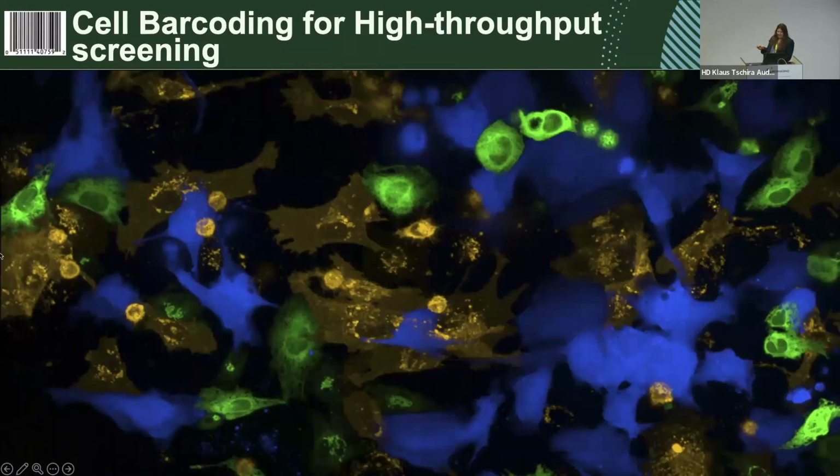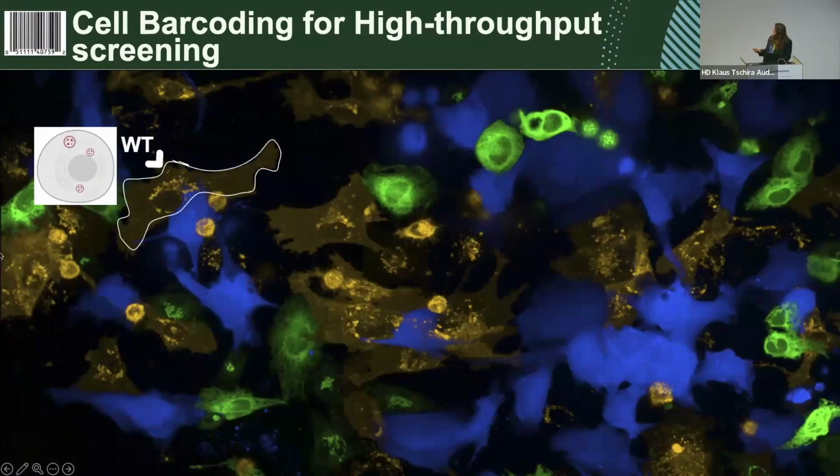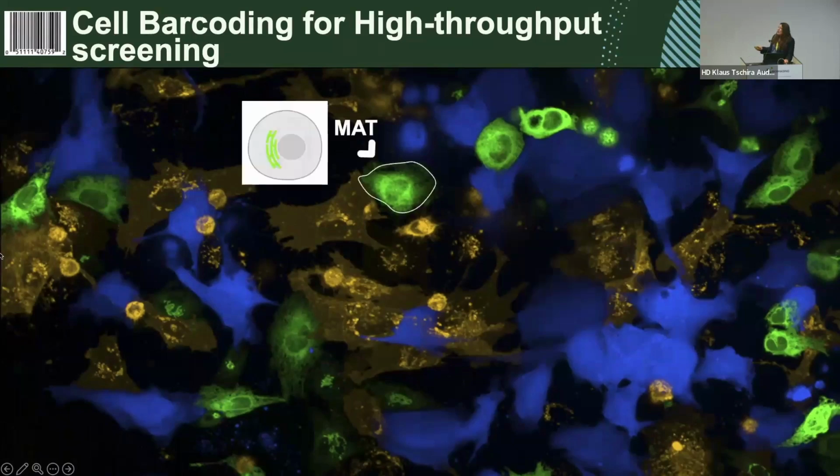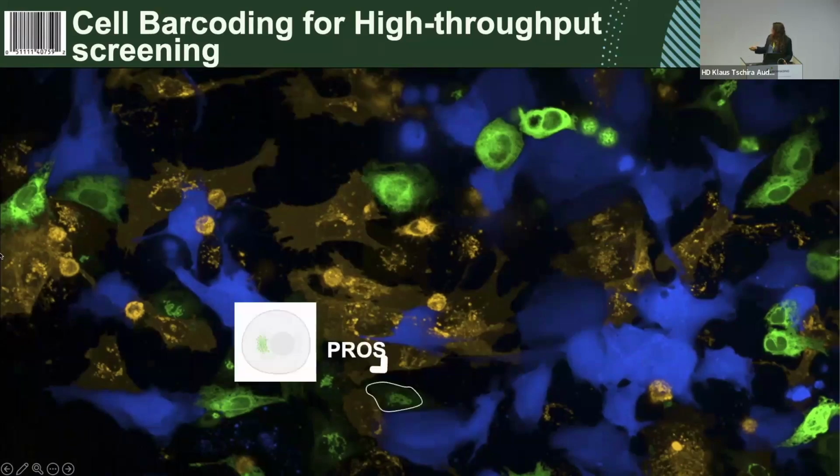You see here, this is the wild type cell. We have yellow in the lysosome. This one is the signal peptide mutant, which has blue in the cytosol. And we also have 2 in green. First one is the mature mutant, which is green in the ER. And the second one is the pro segment, which is green in the Golgi. Okay.